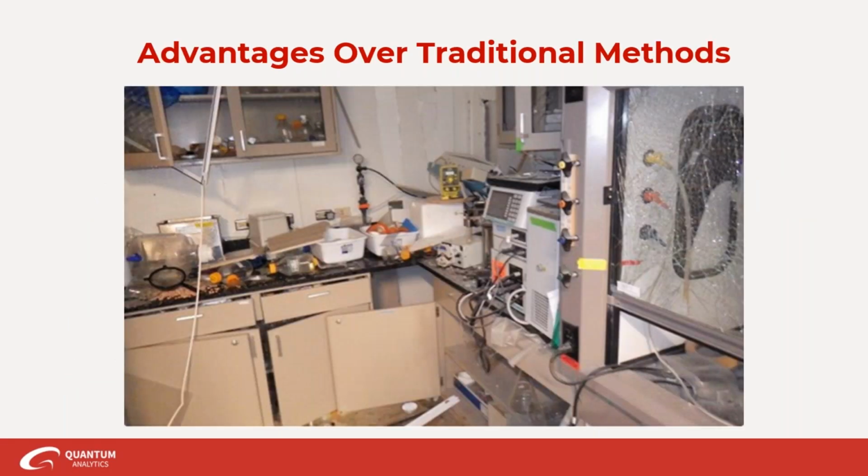There are a lot of advantages in using spectroscopy in general over traditional methods. It's fast, non-invasive, cost-effective, and requires little to no sample preparation. You don't have to sample from dangerous environments. You don't have to destroy your samples. It doesn't require any chemicals or solvents, and it's much less labor intensive. With my job as an applications engineer, my favorite advantage is that once you build your models, you have the ability to measure multiple parameters with a single light scan and spectra reading. I'm going to show you in just a few minutes how you do that.